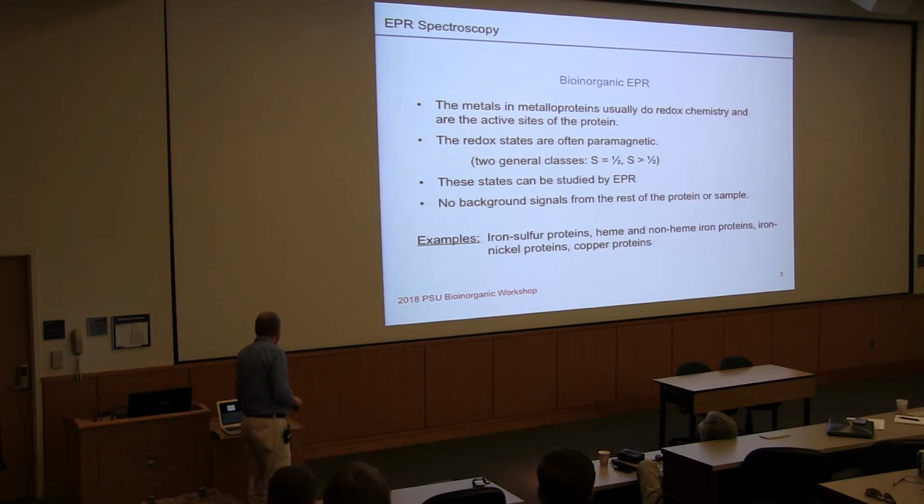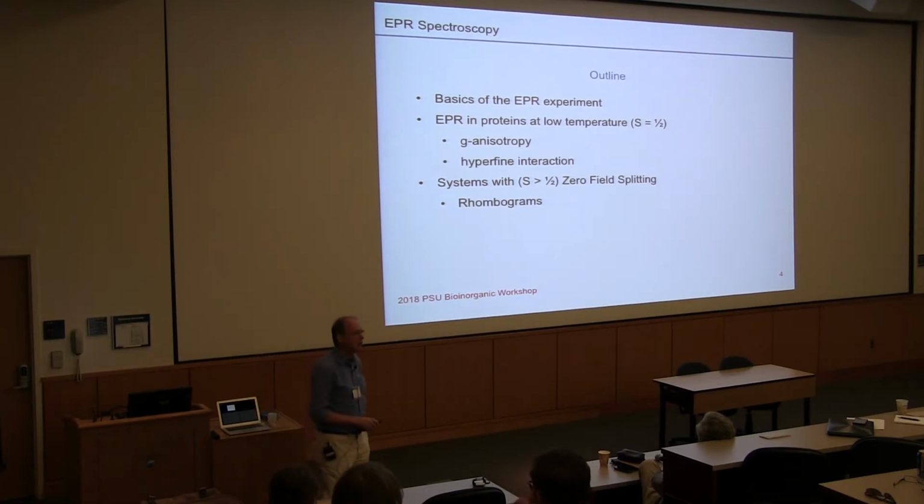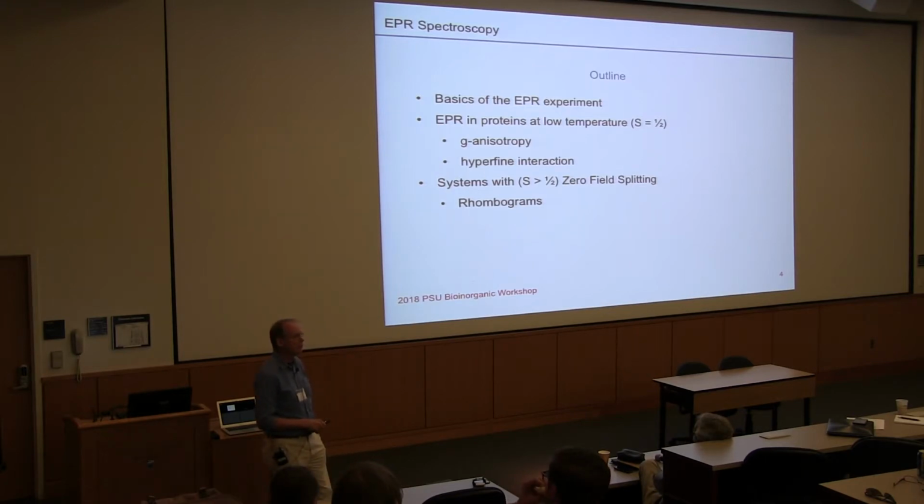All right, so the way I've structured my lecture today is to start by talking a little bit about the basics of the EPR experiment, because compared to other forms of spectroscopy, there are things we have to do in EPR which are a fair bit different.